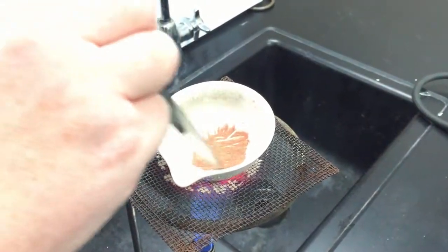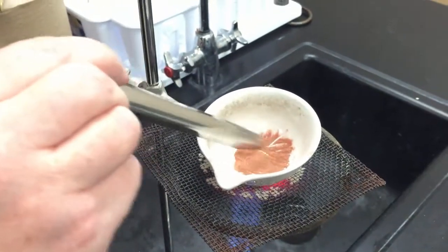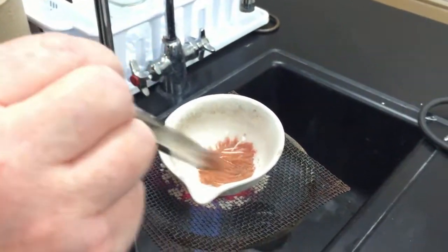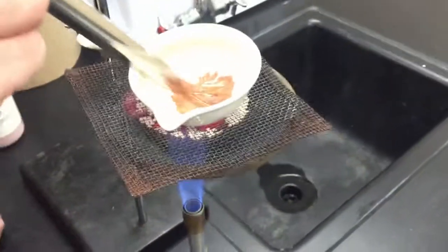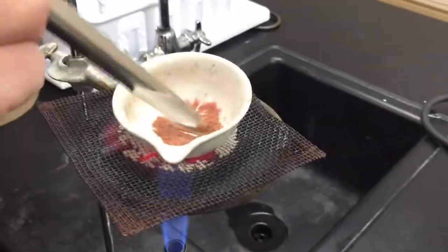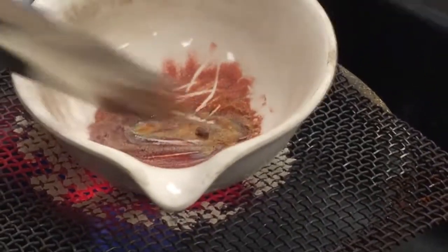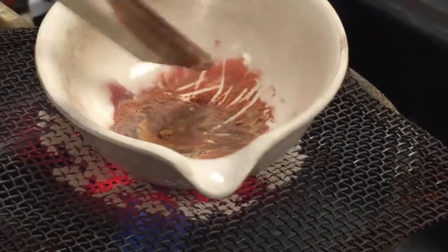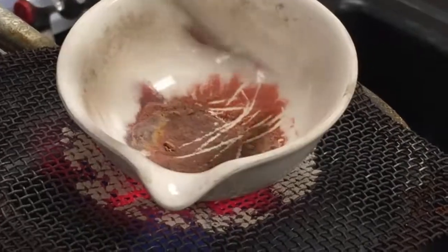You see some discoloration. Seems to be getting more of a brown instead of an orange. It's getting darker. Trying to stir it so that it doesn't stick to the bottom.